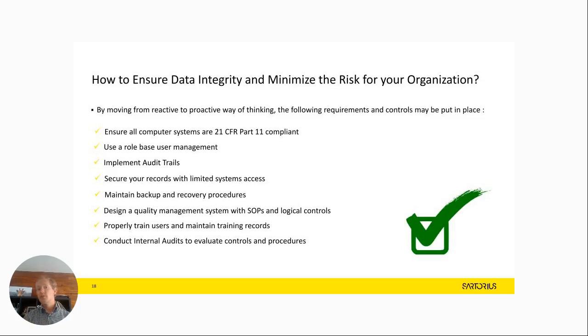Conduct internal audits to evaluate controls and procedures. A lot of different things on that checklist to be compliant. I hope I made it a bit simpler with the, okay, how do we achieve it and what are the different tools for that? If someone asks me, is your instrument compliant?